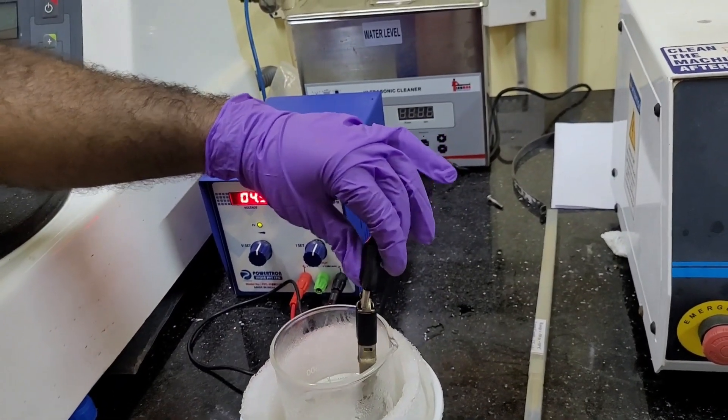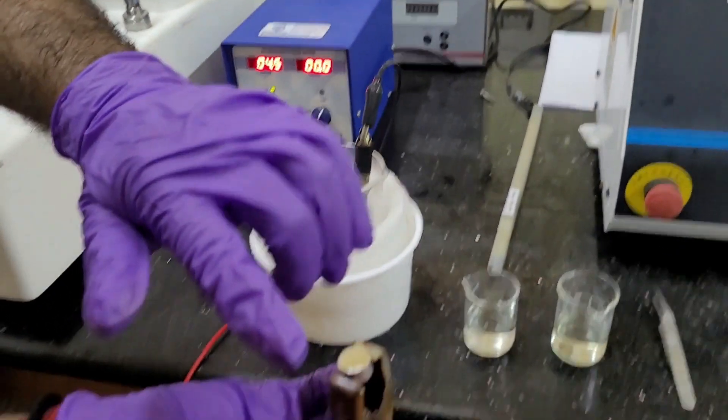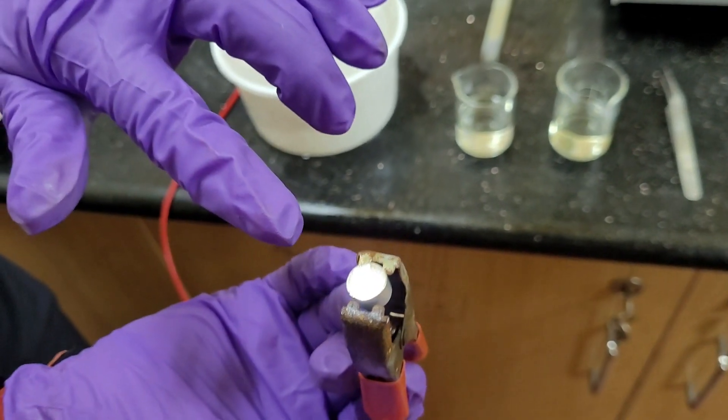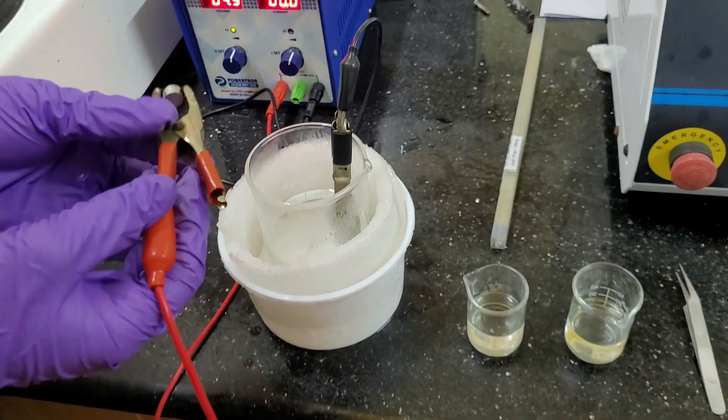First, cathode is already dipped into the electropolishing. Now, this is our sample. This is very well polished by using the standard electropolishing technique, metallographic polishing technique. Now, we are, this is mirror finish of the sample. Now, we are going to do the electropolishing.